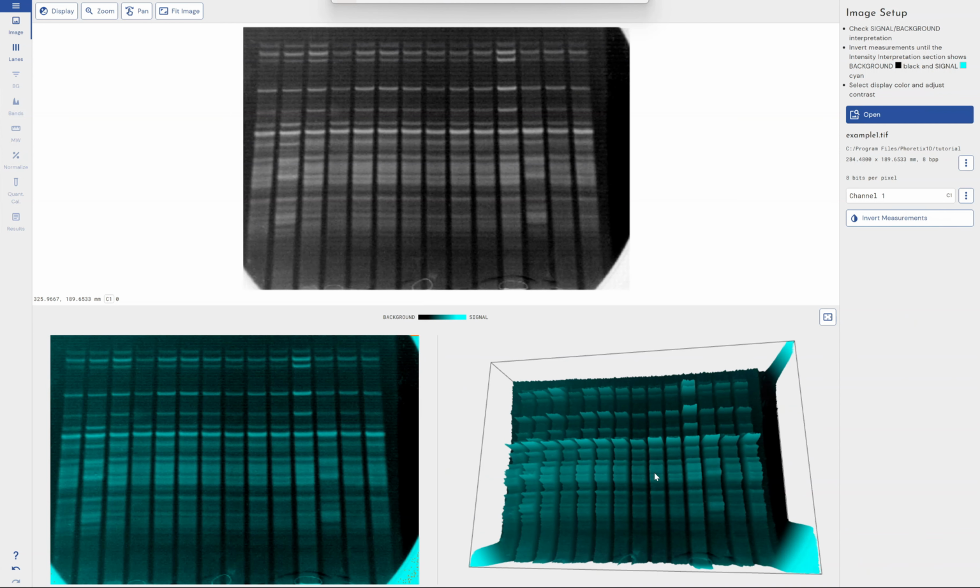That's the activation process. Those are the prerequisites that we need to install to get the software working correctly. And by following this process, as I've just done it here, you can avoid a lot of very simple, avoidable, easy fix kind of support type things. So this should be what you need to do on site to get your trial working, to get your full license working. Those are the procedures that we recommend.